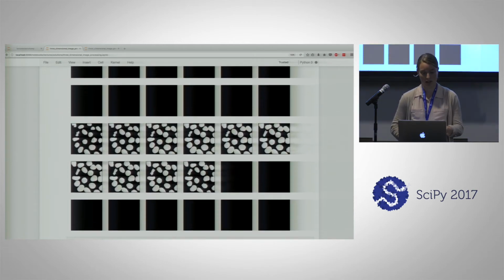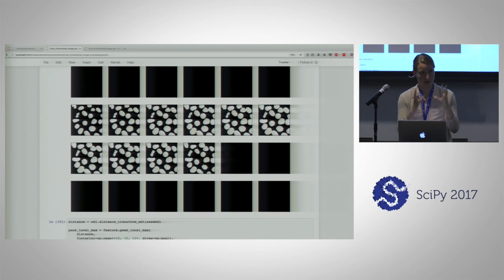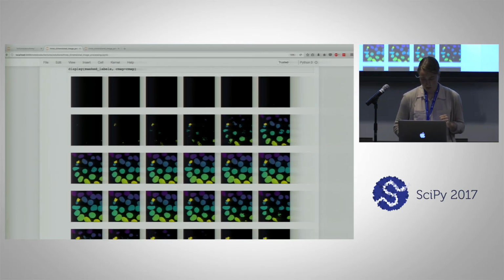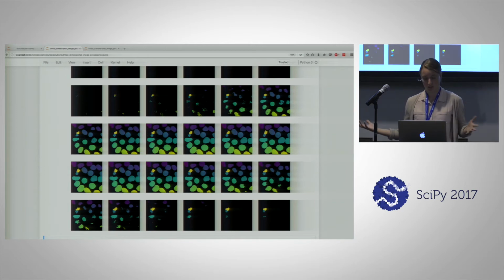So here's now the binary image that we're searching for markers. Each cell looks nice and round. We aren't losing them as they disappear in the planes. And our final segmentation looks pretty darn good. That one cell in the upper left that got put into two regions is dying.